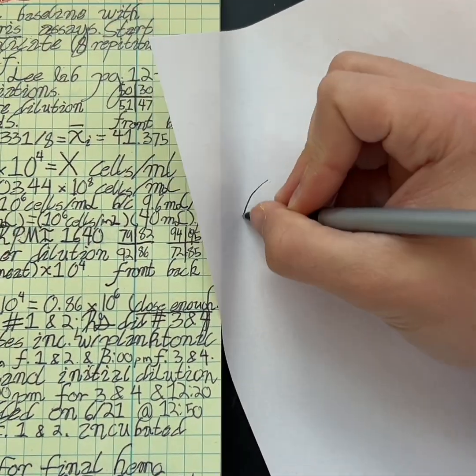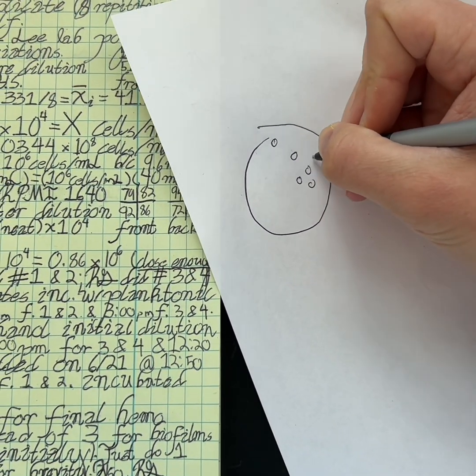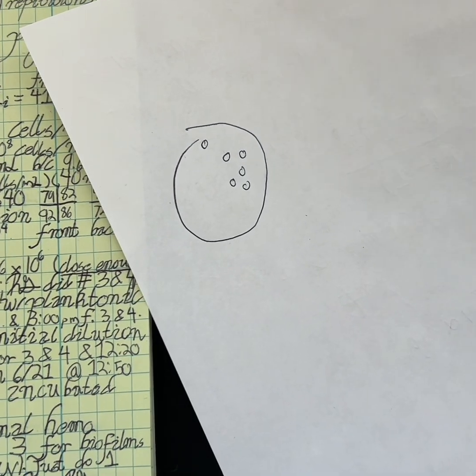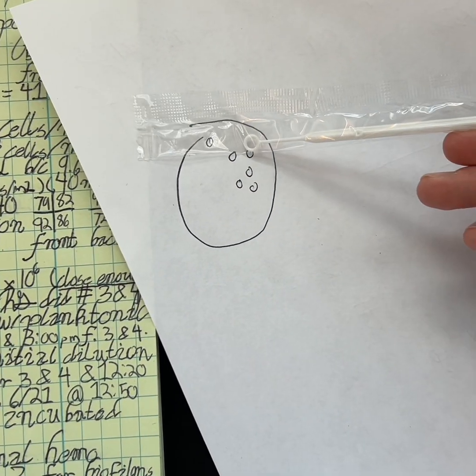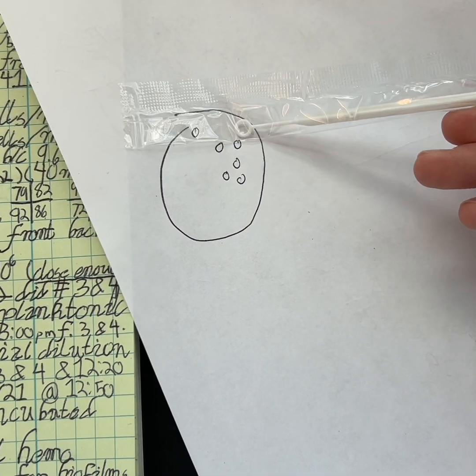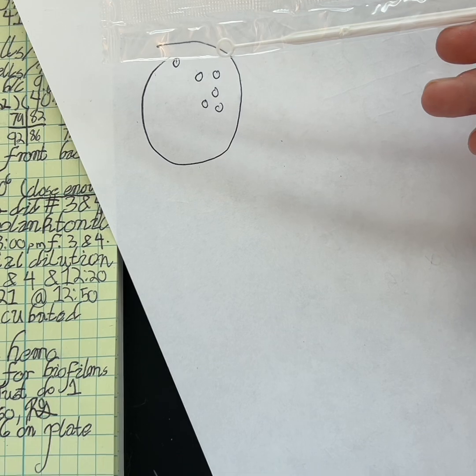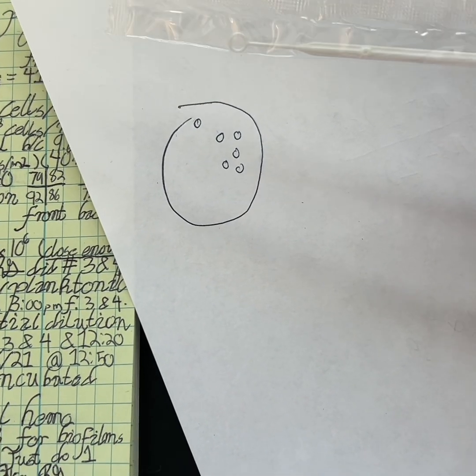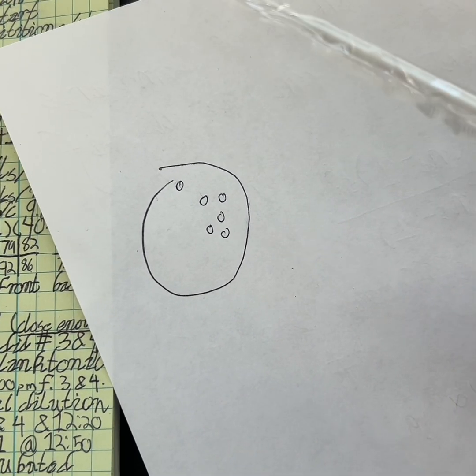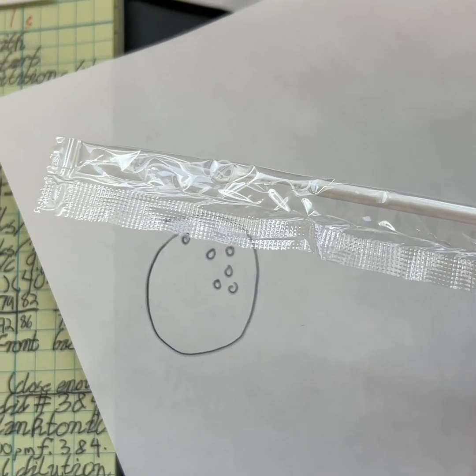So you have your plate, you have some colonies, right? You're going to take an isolated colony with another loop, a day after, whatever. You're just going to grab that colony. You can grab a couple if you want. Just make sure that you're actually grabbing auris colonies and not something else that's contamination. It should be pretty obvious if it's not an auris colony.